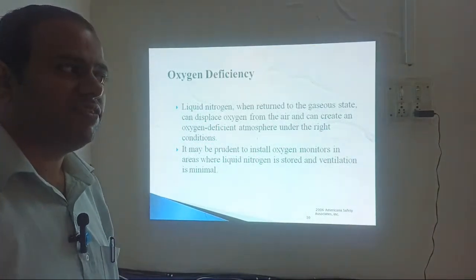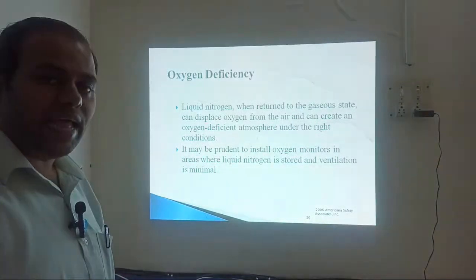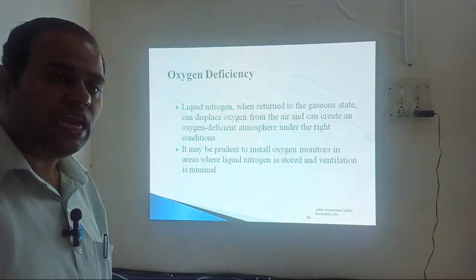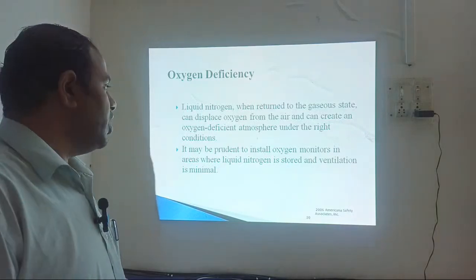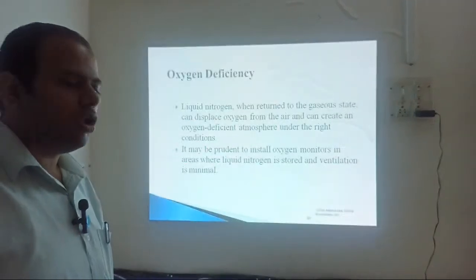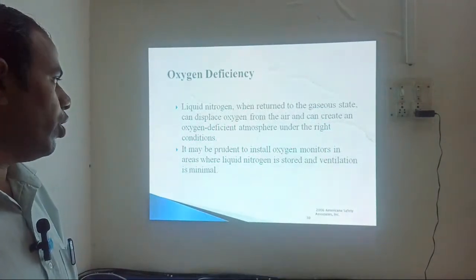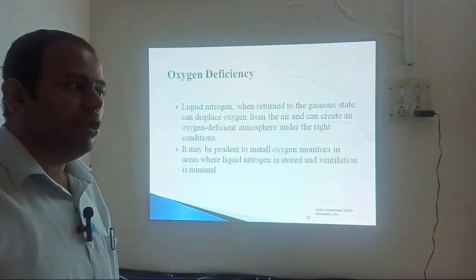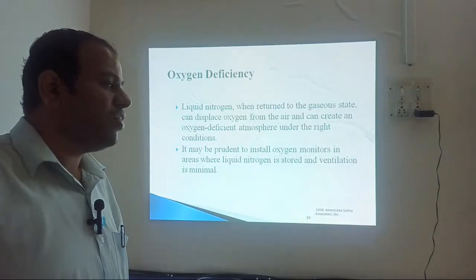Liquid nitrogen tends to diffuse in the atmosphere in that particular area, and the oxygen concentration in that area is very low. So wherever you are storing liquid nitrogen containers, there should be an oxygen monitoring system, and there should be ventilation also, because it may be prudent to install oxygen monitors in areas where liquid nitrogen is stored and ventilation is minimal. Okay, so it can create a temporary oxygen deficient atmosphere, which is very harmful.